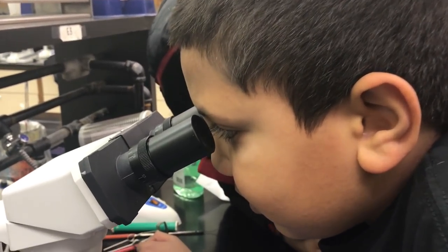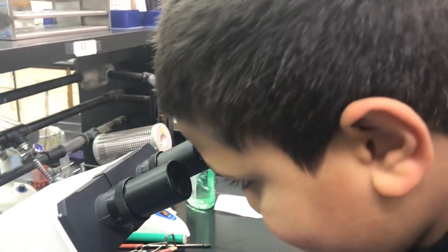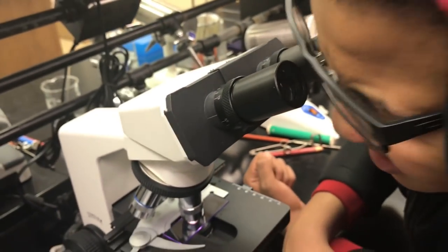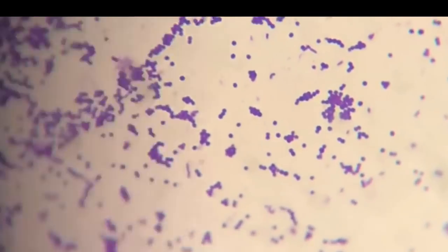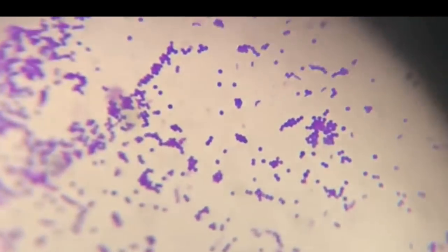All right, so what do you see? What color is it, Jordan? Purple. What's the shape of the bacteria? Like circles. Are they clusters, or are they in chains, or do you see both? I see both. Okay, let me see. I see clusters of circles. I see chains of circles called streptococci, or streptococcus, the organism that causes strep throat. It looks like that.